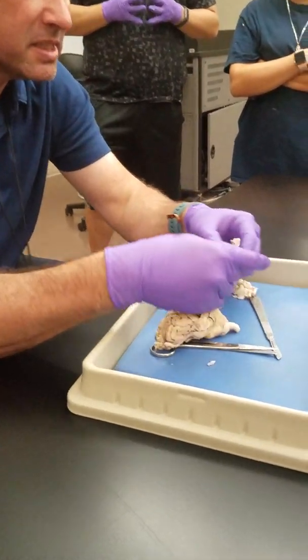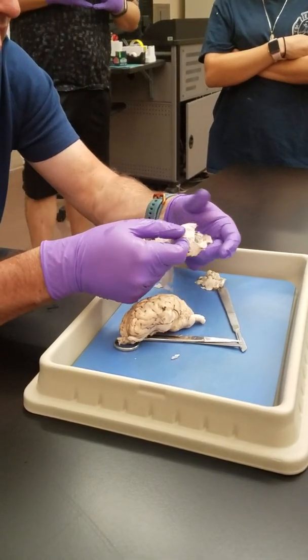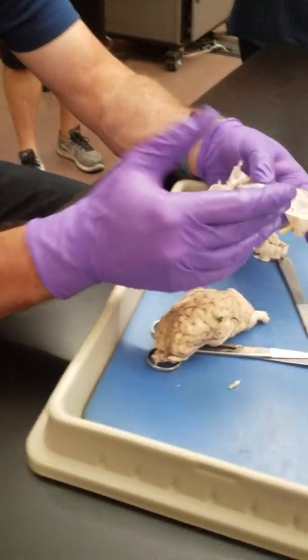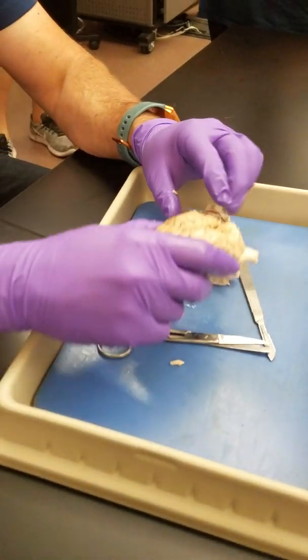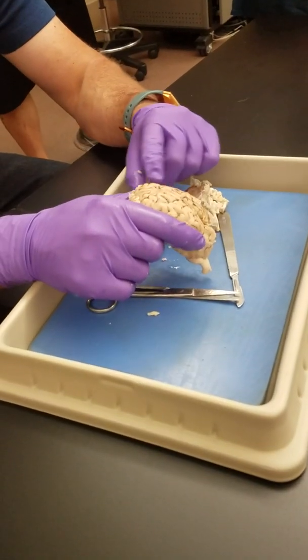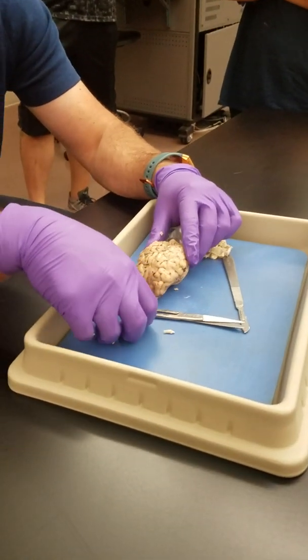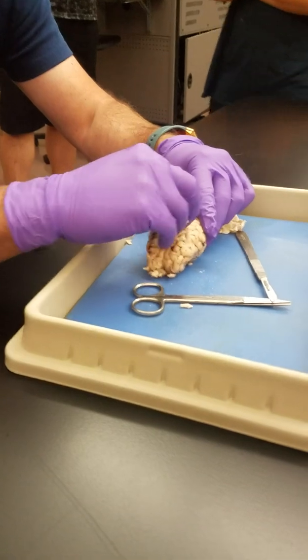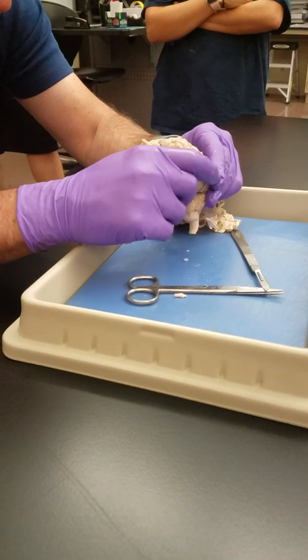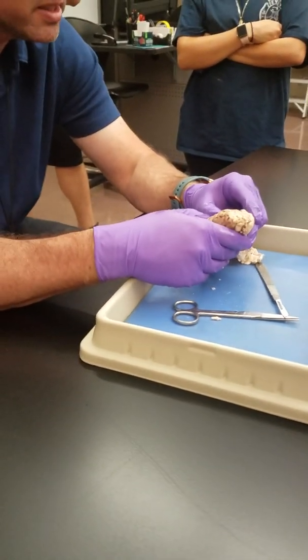If you look here on the inside of it, the outside is the dura mater, the tough mother. Directly on the inside, you can see these really faint little things that look like spider veins. That's the arachnoid mater, which is why we call it the spider mother. And if you look here at the brain, see how the brain's kind of shiny? That is the pia mater, which is attached directly to the brain. You can actually peel off that shiny pia mater. If I had my tweezers here, but I don't. So that's the pia mater that you see right there.